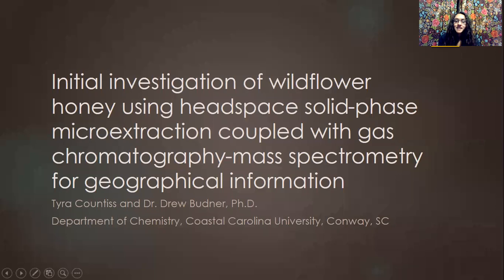Hi, my name is Tyra Countess, and this is my presentation on initial investigation of wildflower honey using headspace solid phase microextraction coupled with gas chromatography mass spectrometry for geographical information.